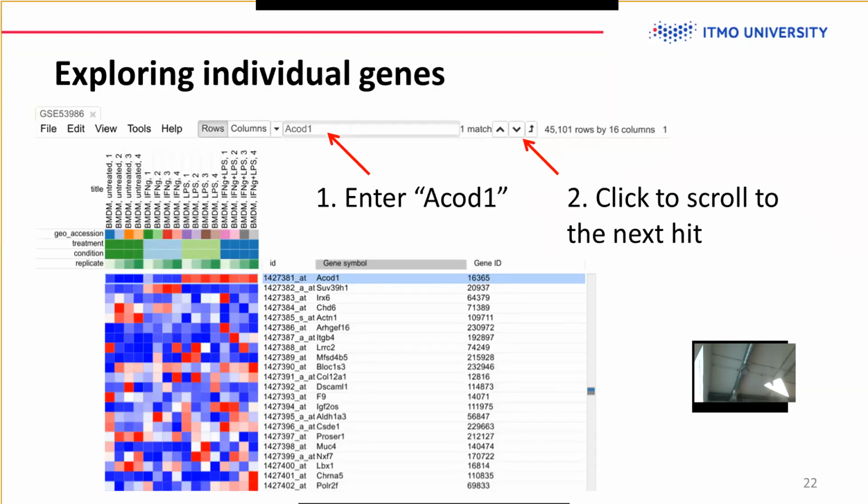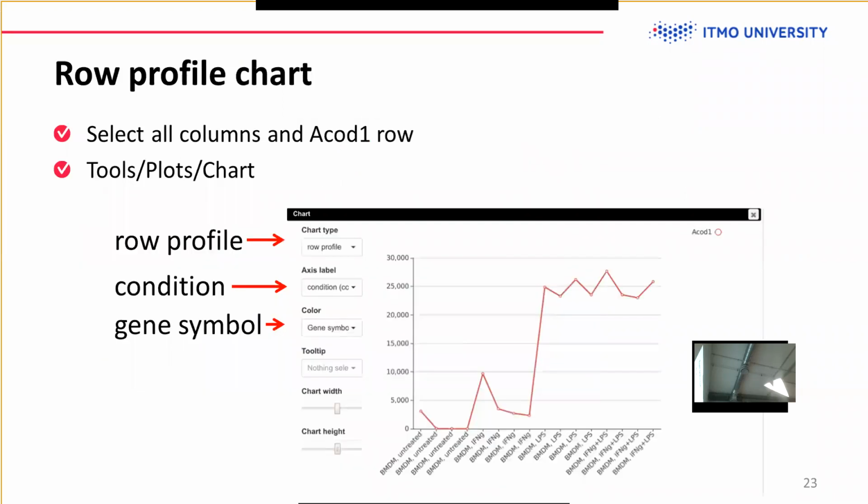However, for pathway analysis or a lot of downstream applications, you usually want to look at genes that are stable, like protein coding, and they are much better represented by Entrez IDs. So your data can come in different types of IDs, like probe IDs, or gene IDs like Entrez IDs or Ensembl IDs, but usually at some point you want to go to Entrez IDs because they are simpler to work with. Although this is not always the case, for some simple analysis this is usually the way.